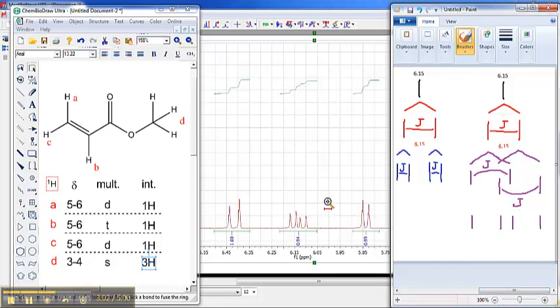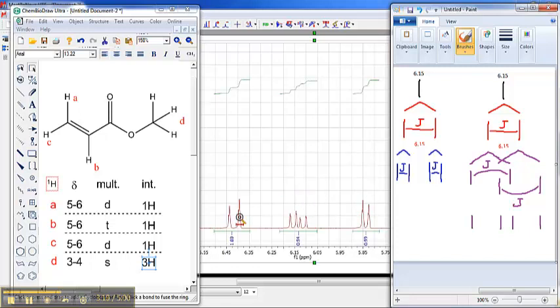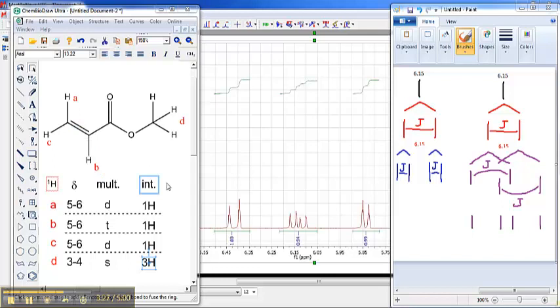So if we return now to the spectrum itself, what do you see? You see a doublet here, which means this proton has one neighbor. You see a doublet here, which means this proton has one neighbor. And what you see here is a doublet of doublets, which means this proton has two neighbors. That is how we decide that this proton must be A — it has a single neighbor, B. This proton must be C — it has a single neighbor, B. This proton here must be B, because it has two neighbors: A and C.